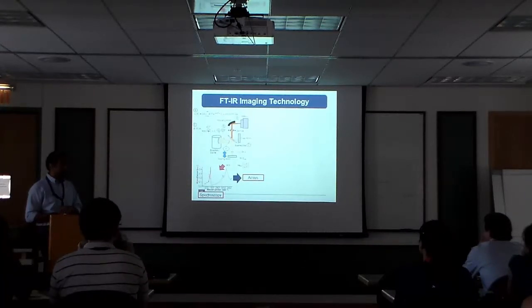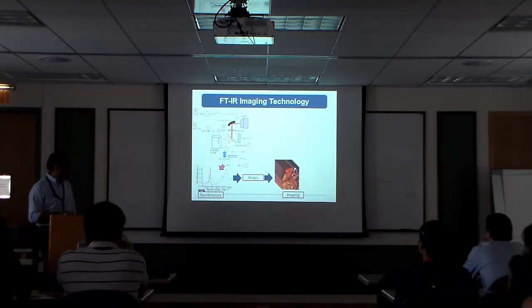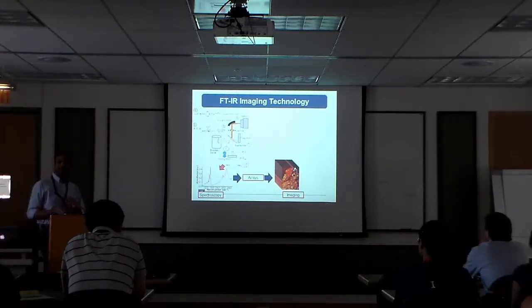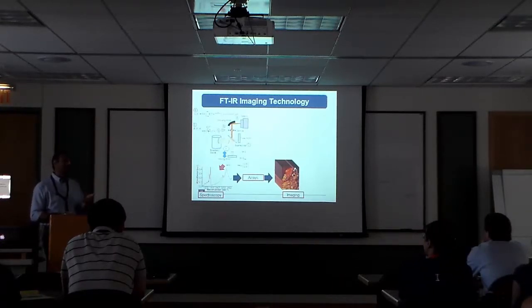We've done a fair bit of multiplexing in this, and this idea will come up again. But what we get now are imaging data sets that look something like this. You have X and Y, and in the Z domain, you have spectral data, right? You could have entire spectra that look like this, or you could have something that we coined the term for and developed first, called discrete frequency infrared imaging, which just means you collect one frequency at a time, but in a way that you can recapitulate this spectrum in some way. Professor Mindo, who just walked in the back, and my group have done some work into which frequencies you should actually collect, right? Because now that becomes a crucial point. Now you have this capability to do this.